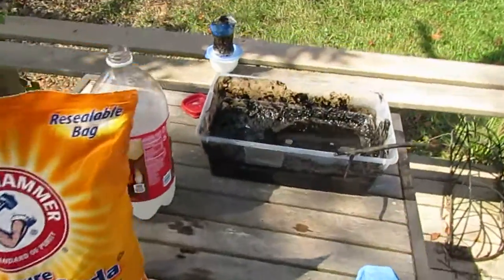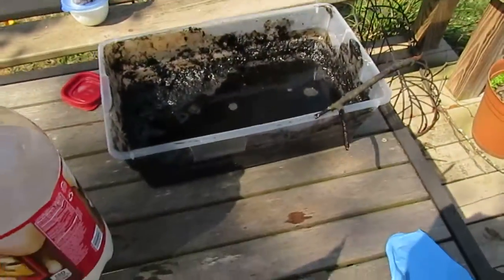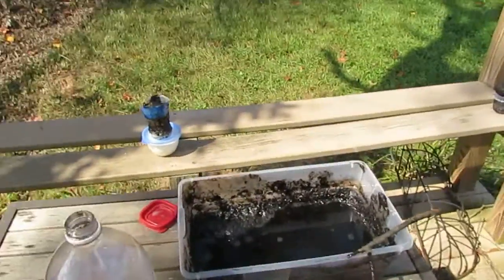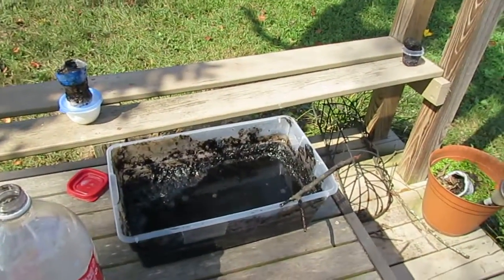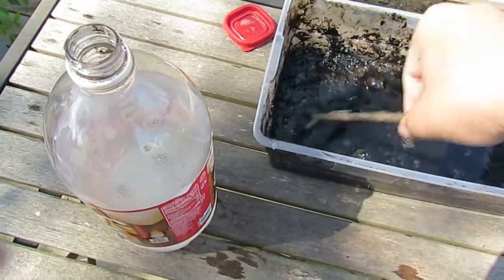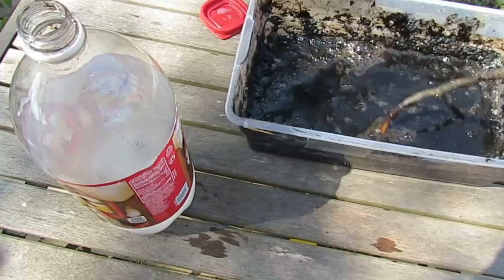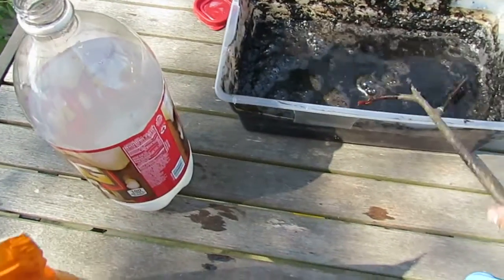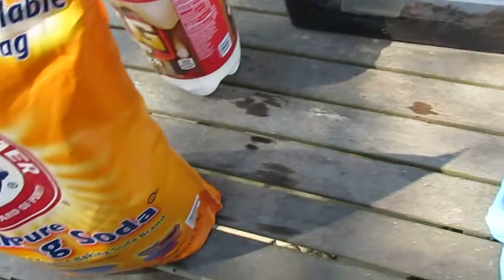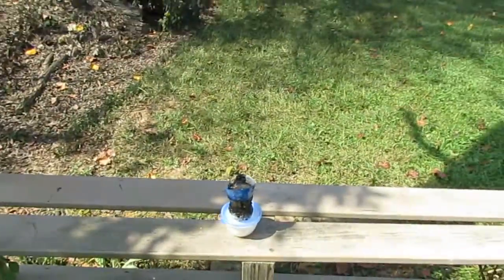Guten Tag YouTube, this is Lightning Flash here and this is part two of my making carbon with sulfuric acid. If you did not see part one, you'll know why this is. This episode we are neutralizing the sulfuric acid to clean out the water bottle which melted.